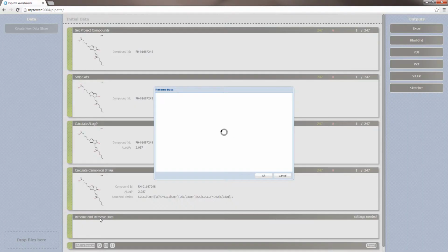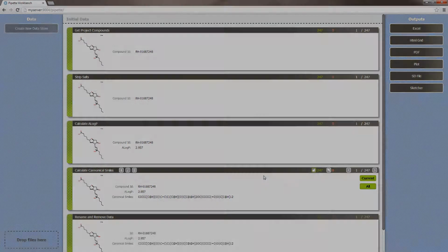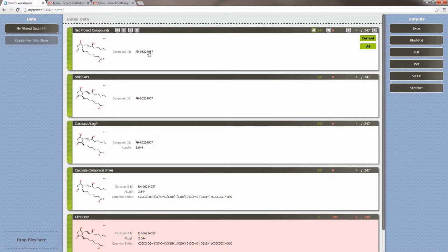On the services bar you always have the sort, filter and remove/rename services one click away. These services understand the properties, types and ranges on your data to ensure these common operations are as simple as possible. Often we want to trace a particular item through the stack. You can do this by clicking on any value that's unique, and then you'll see the first item that has that unique value in each step.